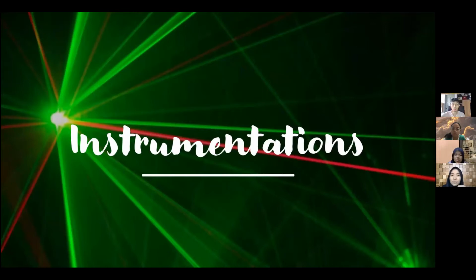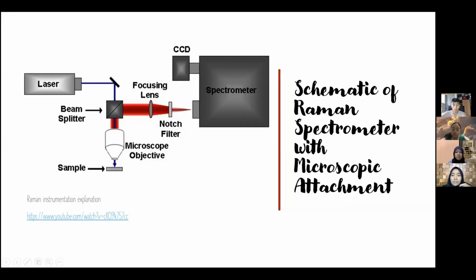So moving on to the instrumentation, this is the schematic diagram of the Raman spectroscopy, known as the Raman spectrometer. In this diagram, we have the laser, which is the source of our light, and then the beam splitter that is used to divide the beam into two or more beams with different flux. Then the focusing lens is used to focus the laser beam.